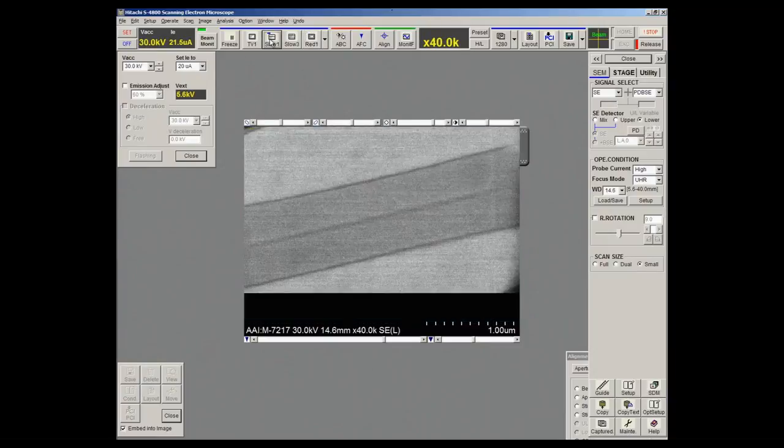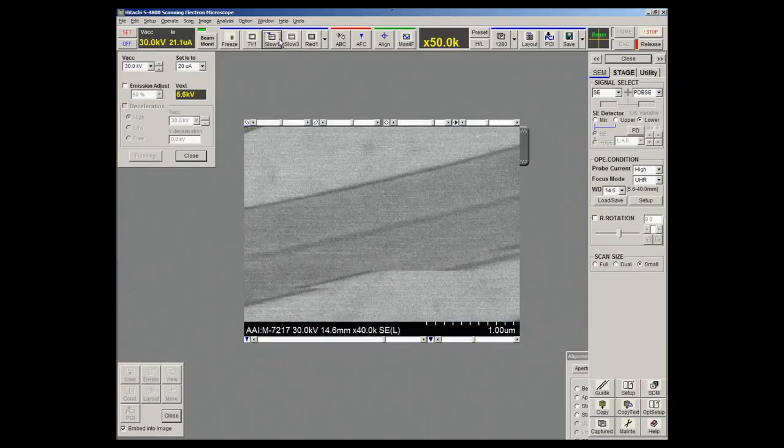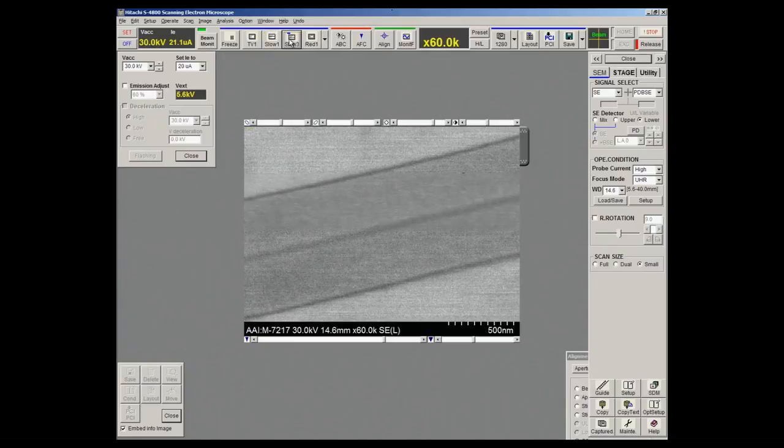So we can zoom in here and look at this crystal. This is, again, the same exact one that I showed in my slide. When setting up the map for this, it's very important to make sure that you line these up so that the beam is going parallel to these interfaces. These crystals are randomly oriented in that polymer, and so when you're trying to take high quality, high resolution data, you need to make sure that geometrically things are lined up. Otherwise, you'll end up with blurring, not as a result of e-beam scatter, but just from the geometry.